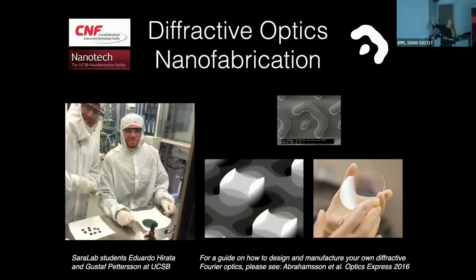Here's an amplitude grating. It's kind of easy to make. It's a chrome layer on glass. Or you can do phase gratings that are transparent. I can see you through this grating, and that's the real beauty of it. So I'll send these around so that you can touch them and look at them.